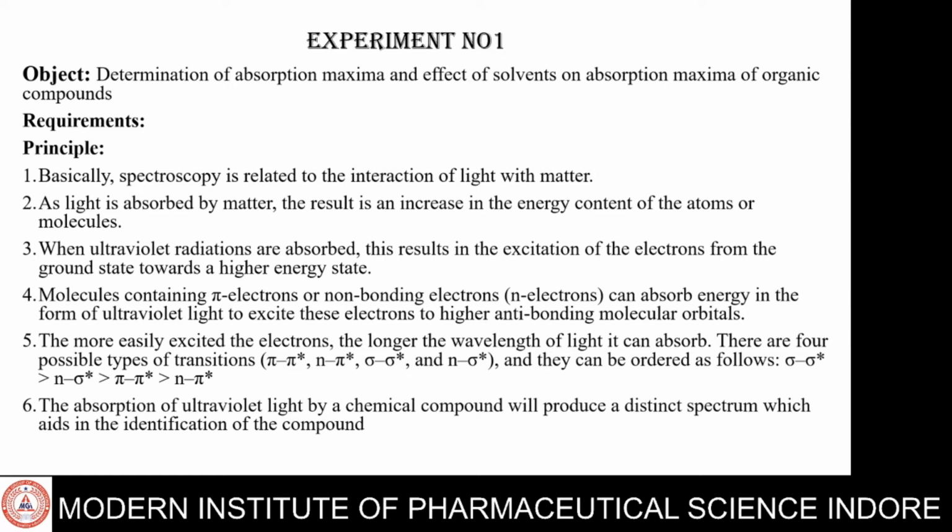Requirements: solvents, UV visible spectrophotometer, cuvette, beaker, pipette, etc. Principle: first we have to have knowledge about the principle of the UV spectrophotometer.